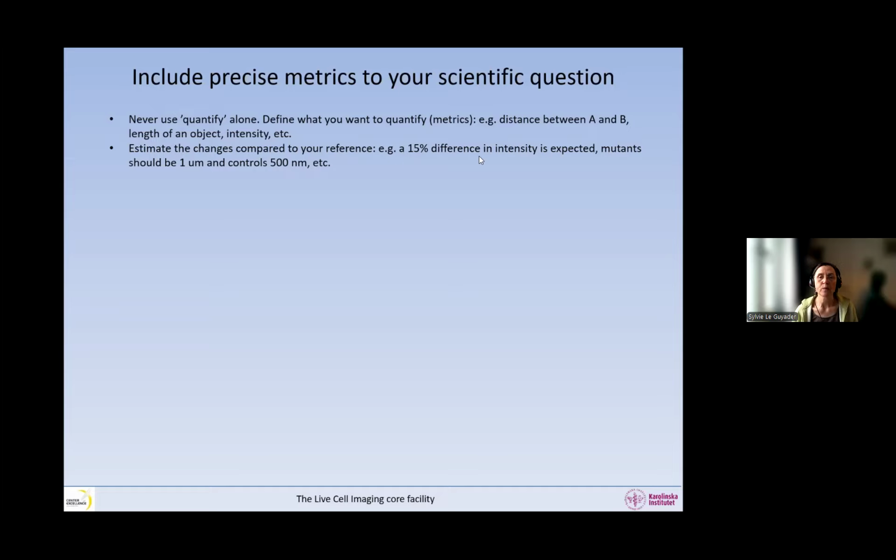So you should estimate the type of changes. If you have a 15% difference in intensity expected between mutant and wild type, for example, you should aim at getting all your settings so that there's nothing that can hide a 15% difference in intensity.